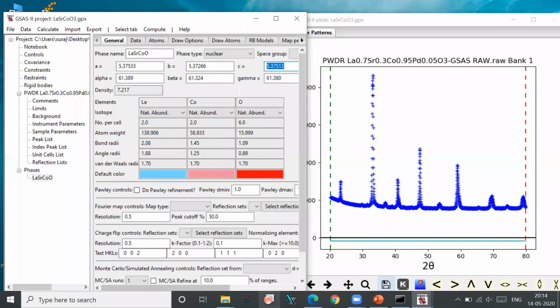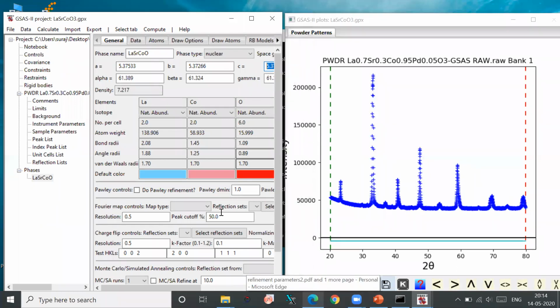Can you just tell them whether the standard pattern is built into the software, or they have to separately load it on the laptop? Yeah, that is an important point. GSAS-II software does not have any standard pattern directory. But if you use Fullprof or TOPAS from Bruker, those have inbuilt standard patterns.